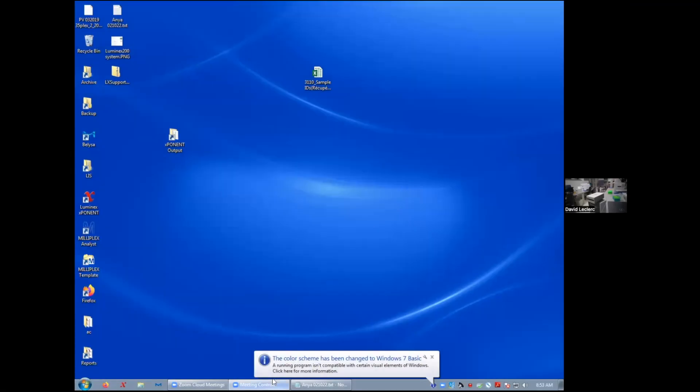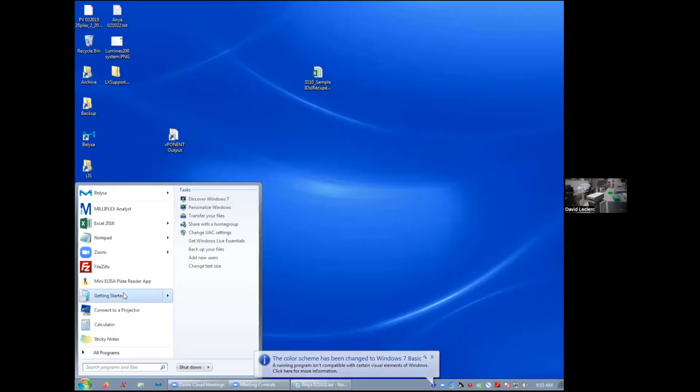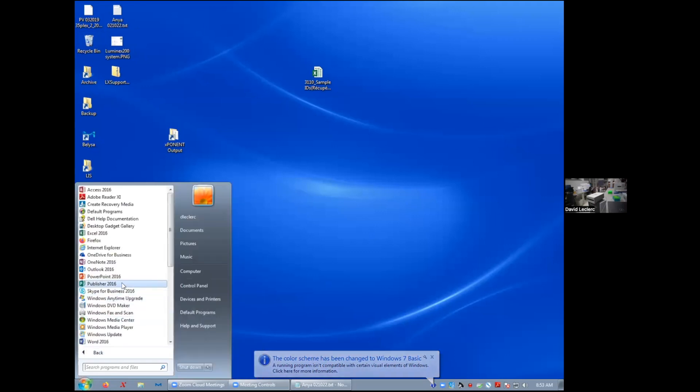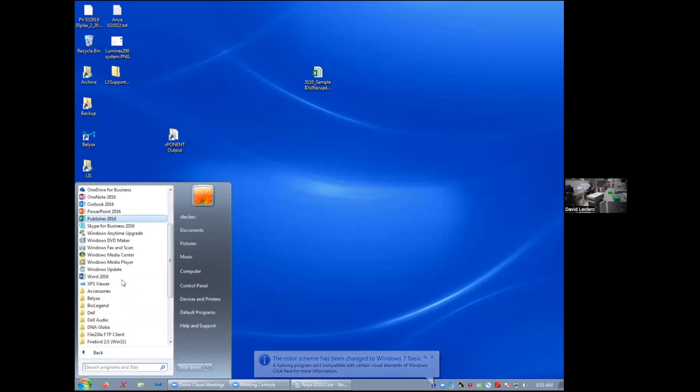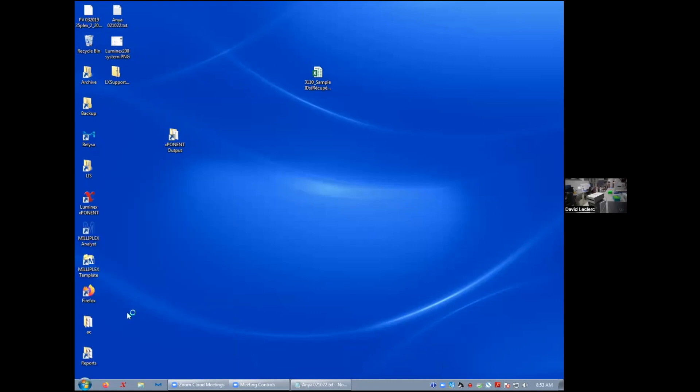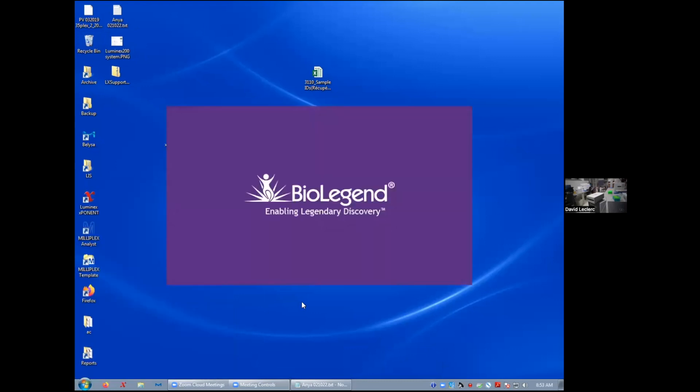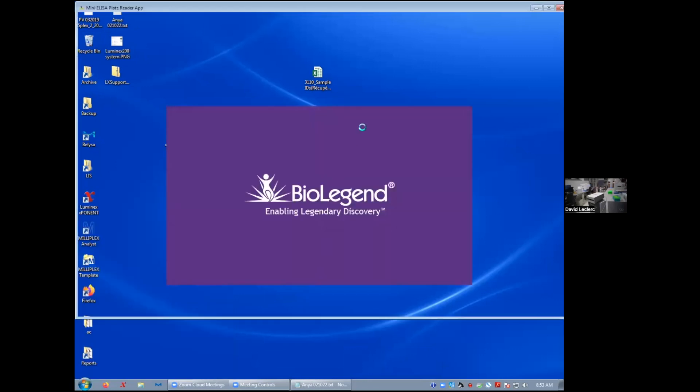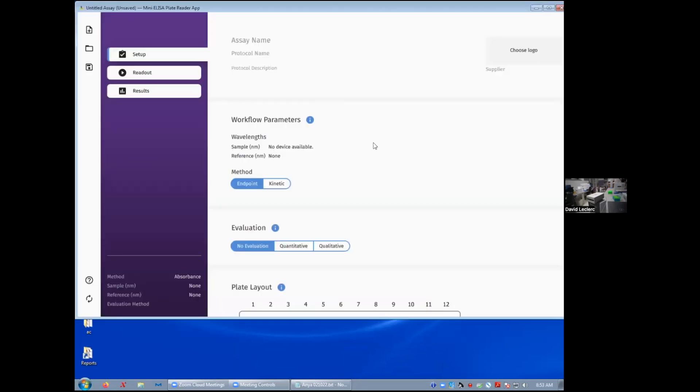So once you install the software, you'll find it under the BioLegend folder. It's called mini ELISA plate reader app, and it's quite straightforward.